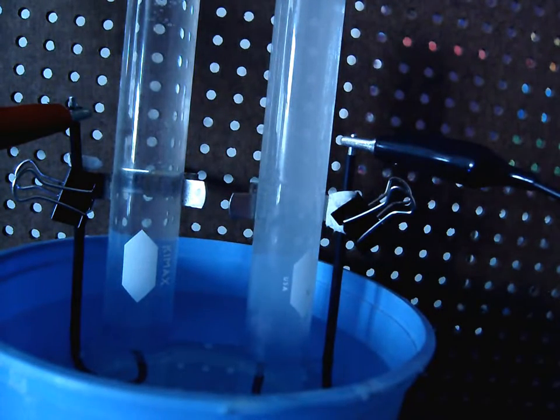So once the hydrogen and oxygen break apart, they are attracted to their respective electrodes, and basically run over to the electrode and turn into their gas state. And because gases are less dense than water, those gases will rise, which is why we have to have the test tube directly above the electrode. So as the gases are rising off of the electrode, they are being collected in the test tube.